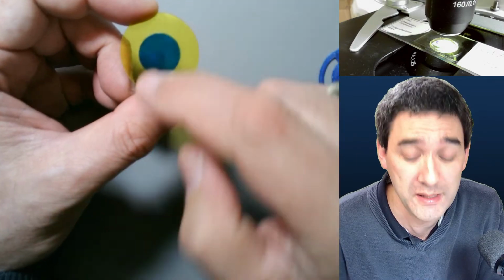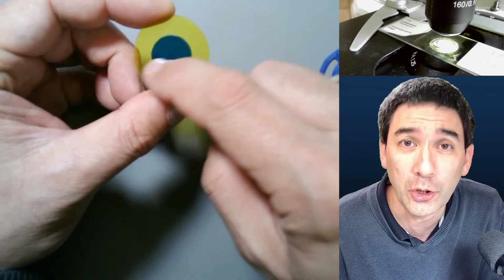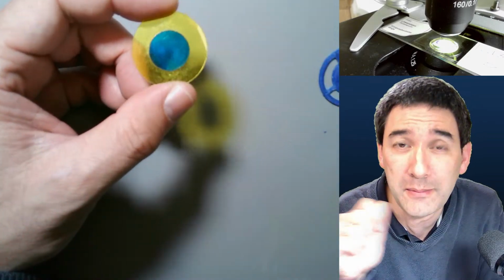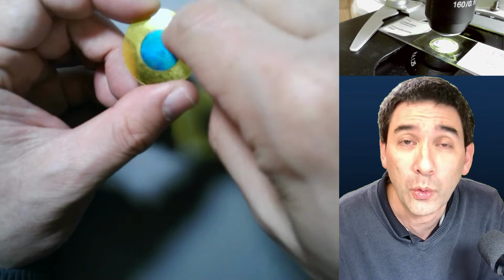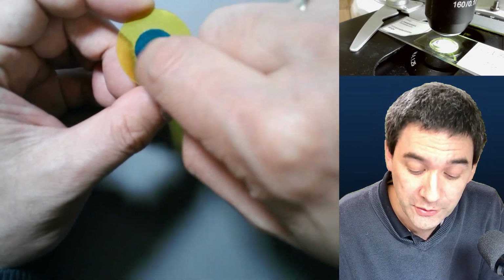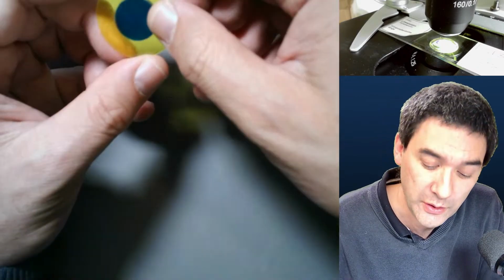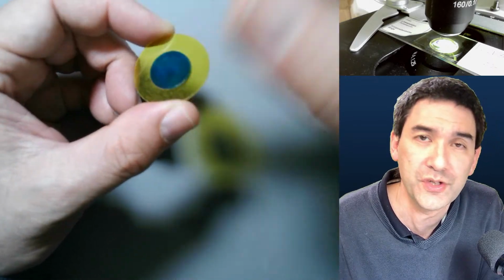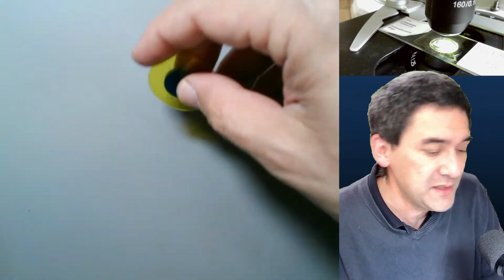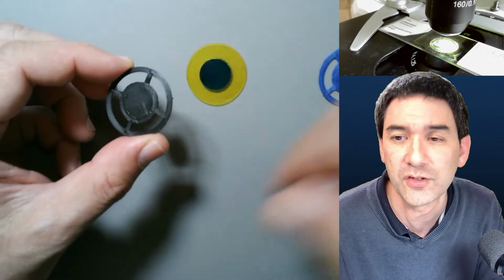And if it is not completely dark when you print it out with a laser, then I recommend that you also take a marker and make it additionally darker, or that you stack several of those on top of each other. Once you've got the proper size of the central disc, you just remember that, and then you can make different color filters as well. You're just using the same dimension. But for determining the size, I think it might be easiest to simply use dark field, because the effect is the strongest.